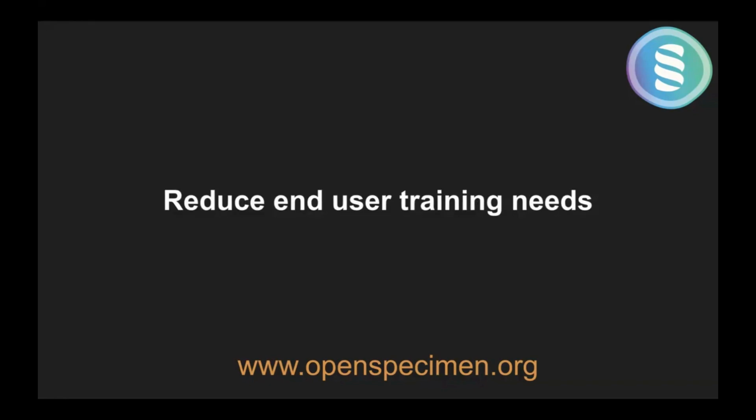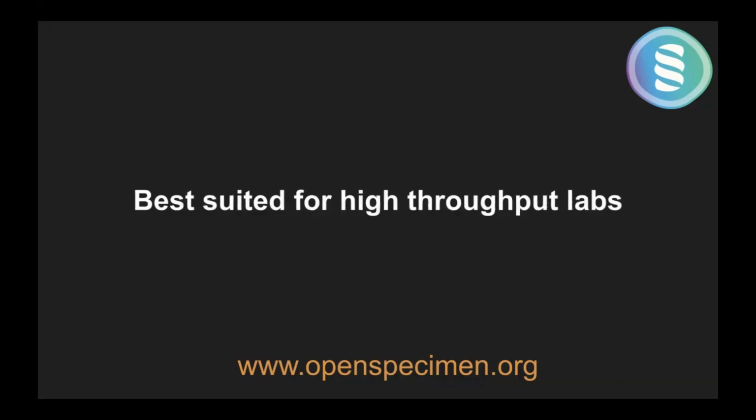And since the user is now limited to doing a fixed set of things, the amount of training, asking people to go there, do this, next do this, and don't forget to do that, all would get eliminated, because all they need to do is follow the step-by-step process. Of course, if you're a small biobank with fewer specimens, it probably doesn't make sense. But the more specimens you're processing, the more benefits and savings the workflow module will bring in.